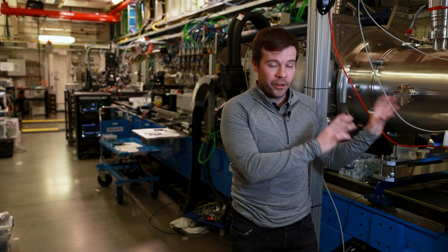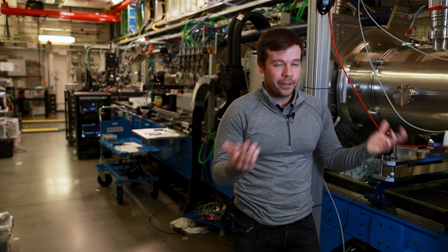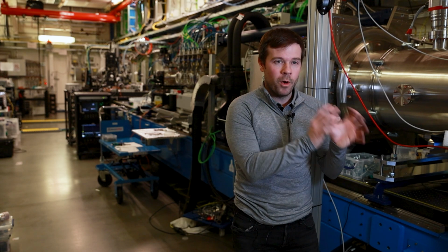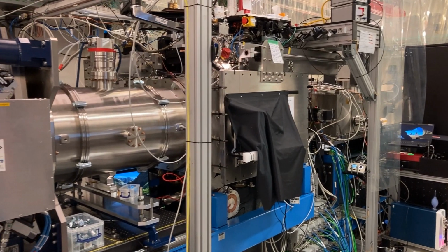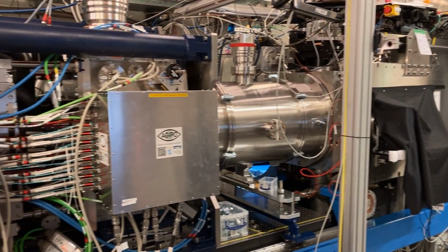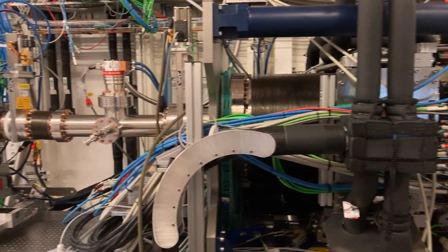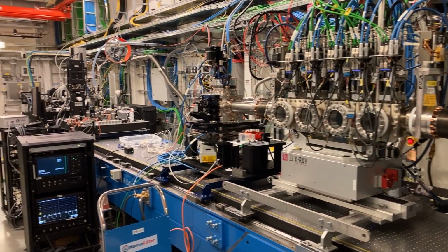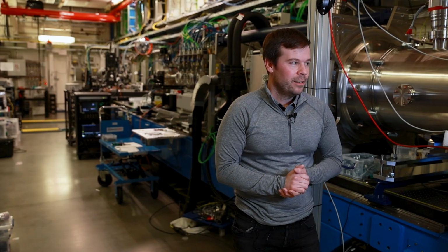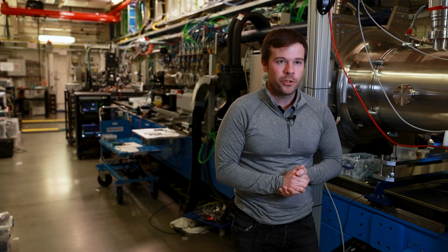So the instrument here at SPB is specifically conducive for using these liquid jets, unlike other instruments which have very small vacuum chambers. SPB has a large vacuum chamber which is able to handle the large liquid flow that are characteristic of these types of liquid jets. That, together with a high repetition rate of both the X-rays and the detector, makes it uniquely suited to carry out this type of single particle imaging.